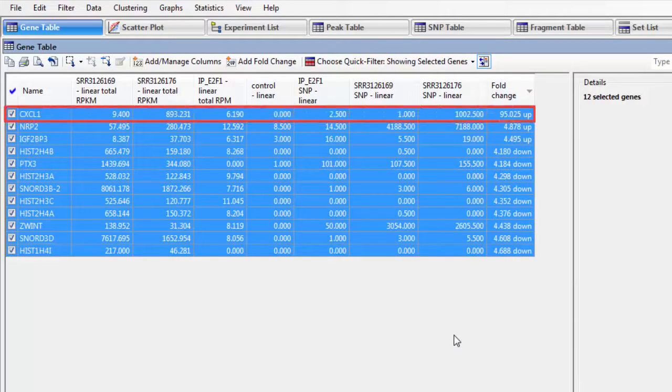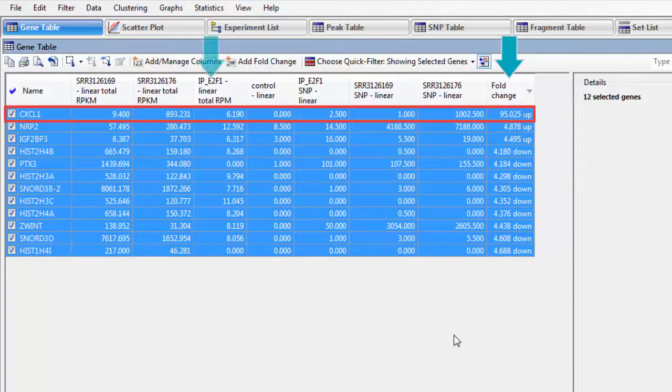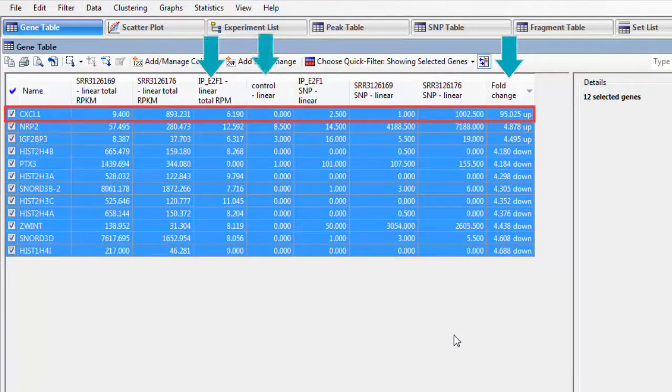And here at the top, I see an interesting gene with a significant increase in expression and an IP signal that's high in the ChipSeq experiment and low in the control.